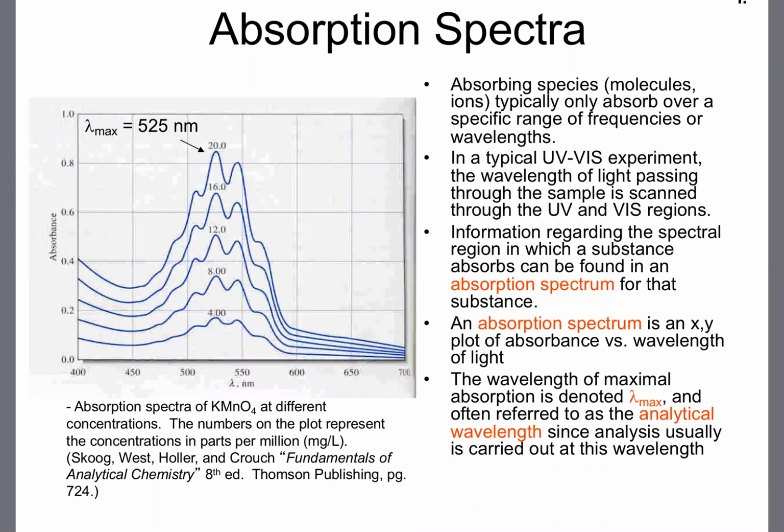The purpose of this slide is to define, if you didn't know, what an absorption spectrum is. And to be really forward, an absorption spectrum is this plot. It's a plot of absorbance versus wavelength, okay? And wavelength is often expressed in nanometers if we're doing UV-vis spectroscopy. Absorbance versus wavelength. So why make this type of plot? And how do we do it?